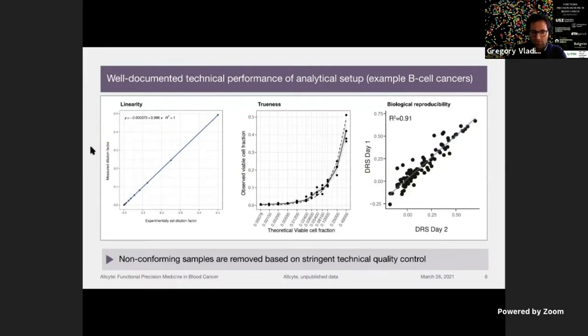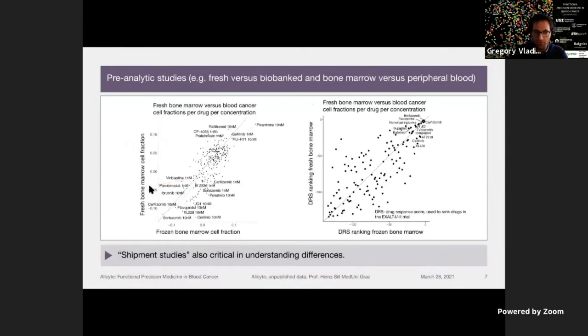And it's not just, okay, well, we have these pieces of information, but it's also the ability for us to really leverage our data a little bit better if we understand day-to-day performance attributes or user-to-user or patient or sample-to-sample attributes. And it's not just technically understanding our platform, it's also the pre-analytic studies on the material itself.